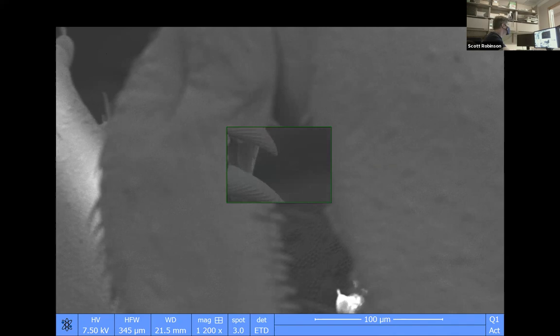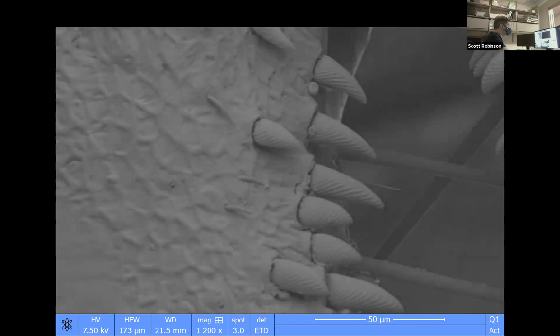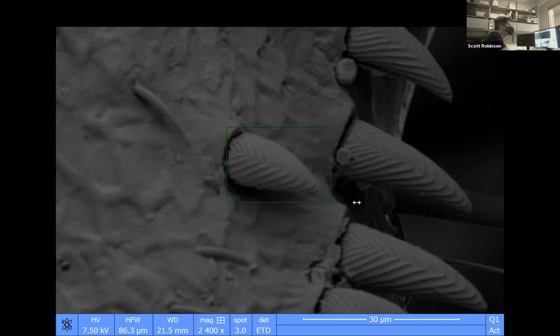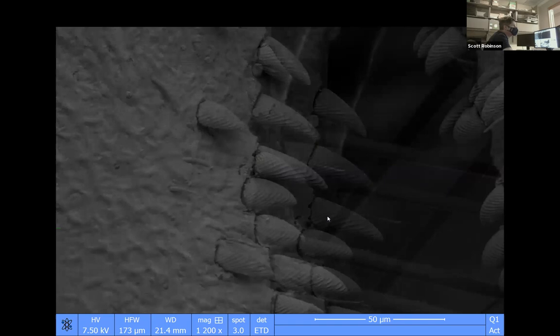So let's fix the contrast and brightness a little bit. I have to do it manually. I'm going to pull the contrast up and pull the brightness down. And so these are really beautiful little sort of teeth or tines that are on the insides of these really sort of muscular looking arms.